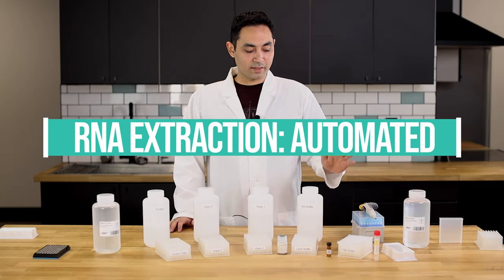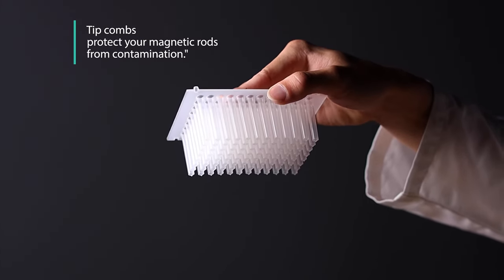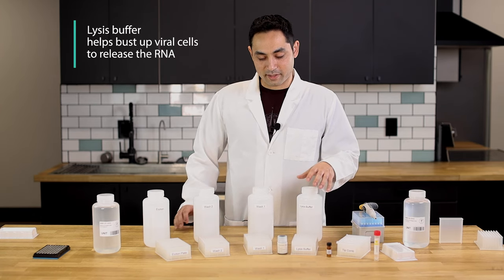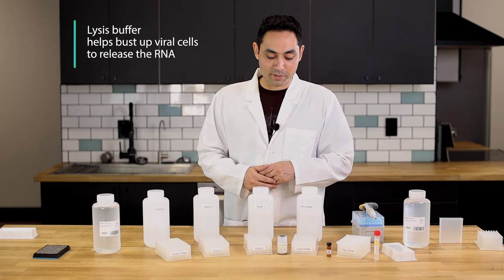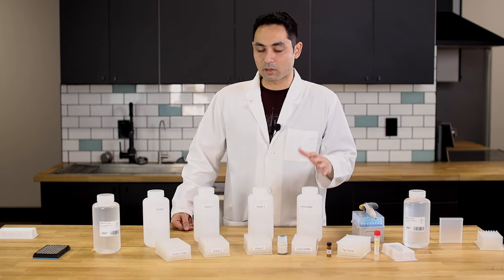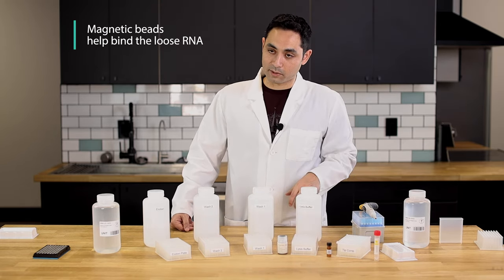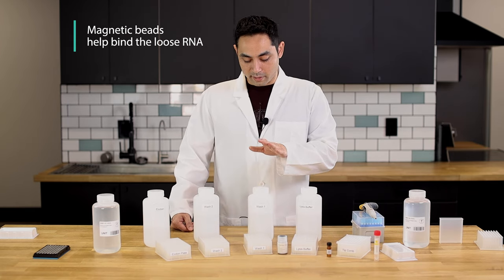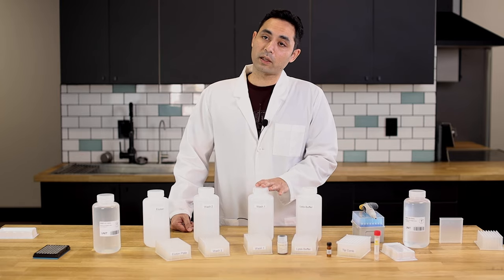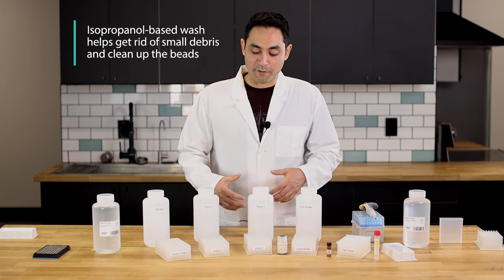Let's talk about the plates. In the first plate you're gonna have your tip combs — this is gonna protect your magnetic rods from contamination, kind of like contraceptive for your magnetic rods. The second plate is gonna be your lysis buffer, which is gonna help bust up those viral cells and cause them to release the RNA. It's gonna have a guanidine-based salt, might have phenol chloroform and other things. You have your proteinase K which denatures protein, and of course your magnetic beads which help bind the loose RNA. The third plate is gonna have an isopropanol-based wash to get rid of small debris — this is the first step in cleaning up the beads.